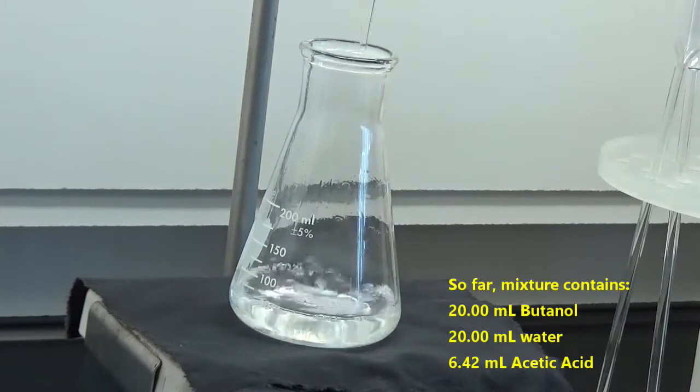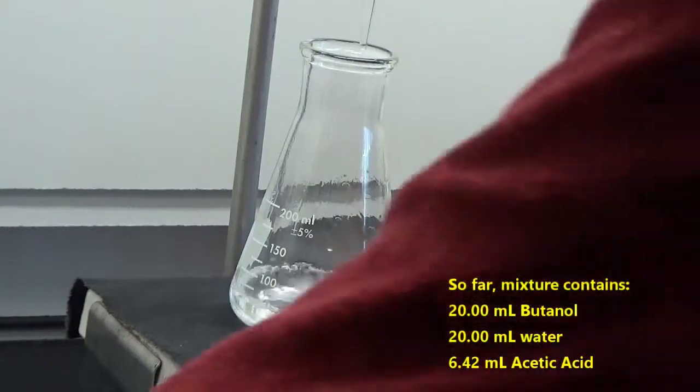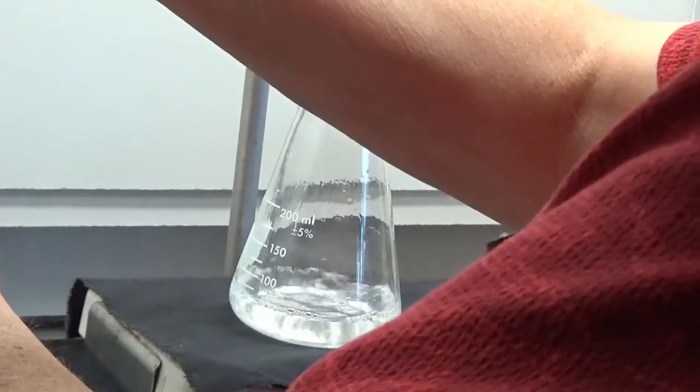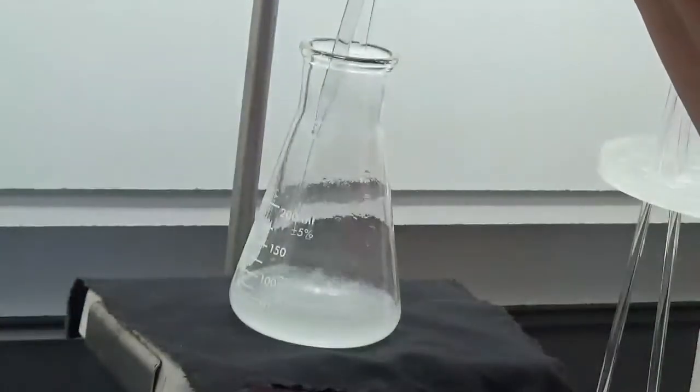I'm going to add 5 milliliters again. And it clouds right up.